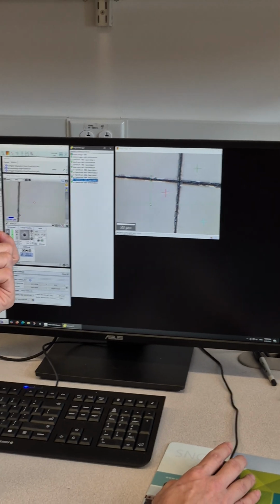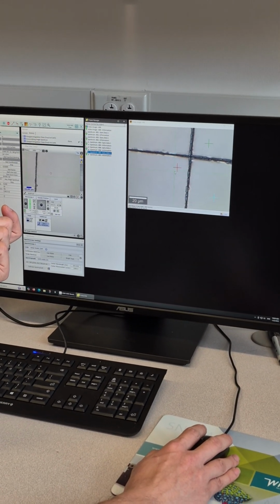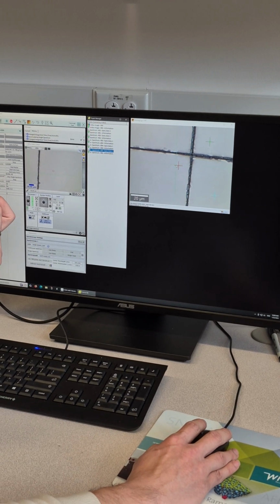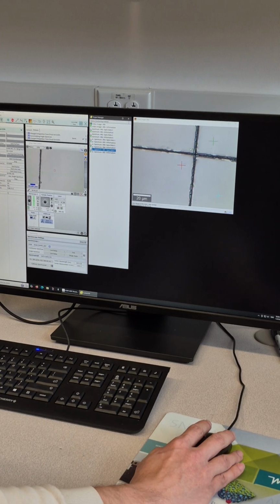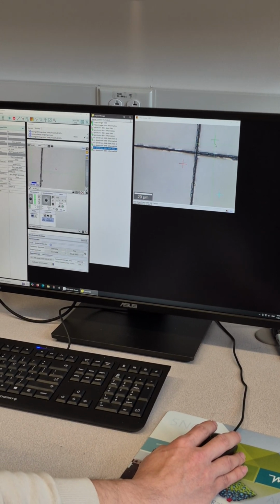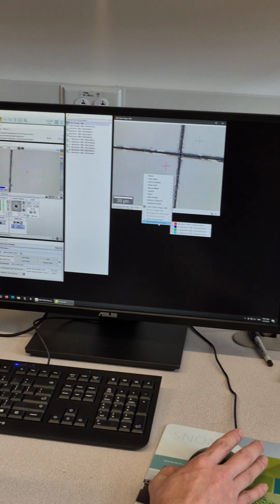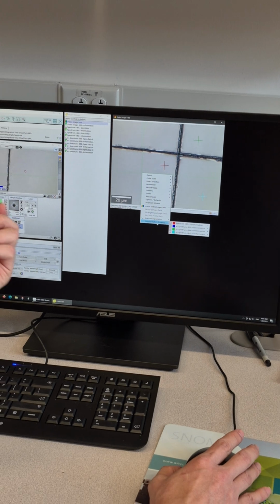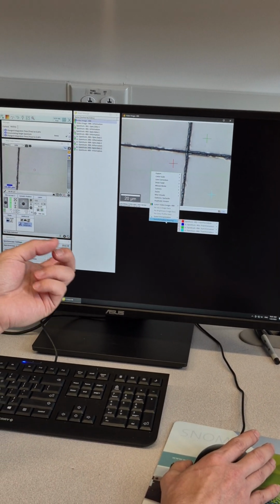Now, because the 3 and the 1 are in the same position, the 3 should be blue, but it overlapped with the red. Once you put a bunch of crosses, you also forget what the green means. So you just right-click the image and you see the transform drawing. It shows you the red is 001, the blue is 003, the green is 4, and the cyan is 5.